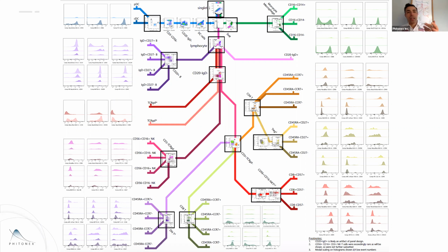The other reason, though, is also that we leverage the NovaFluors and their clean fluorescence to look at variable and low antigen density markers here, right? For instance, some of the chemokine receptors, right, where you're getting a lot of biological variability, which is interesting, right? And they might not fit into nice, neat little bins, and that's fine, right? And I just quite like that notion. So we've also just essentially thrown this against the wall and said, here you go, right? And it's exactly what we're doing now for the 45 color data.